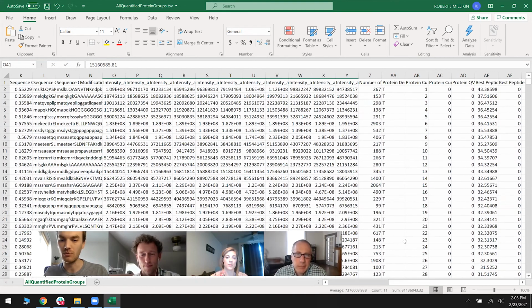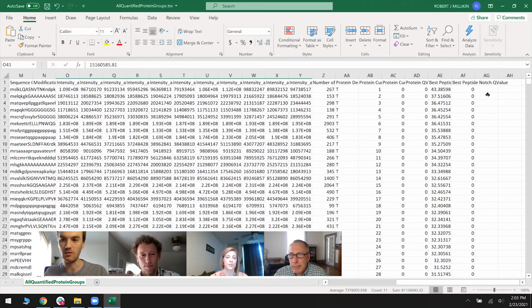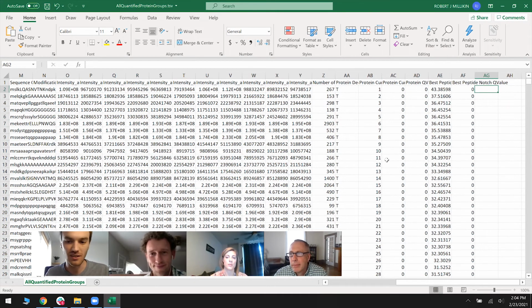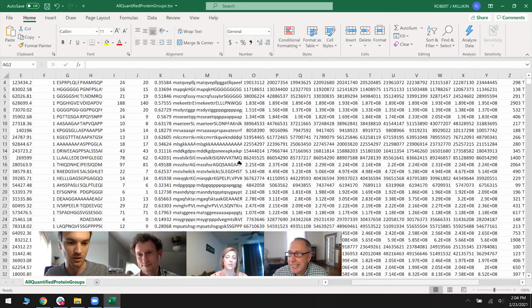So typically what you are looking for in a quantitative kind of LFQ context is what's called a fold change. So how much a protein changes between samples. That's because this is a relative quantification. It's really not an absolute quantification. So I won't really go into that much, but if you, for example, take an intensity in the 3x condition and divide that by an intensity in the 1x condition. This is a human protein. That's why it's about 1. So it actually should be about that.